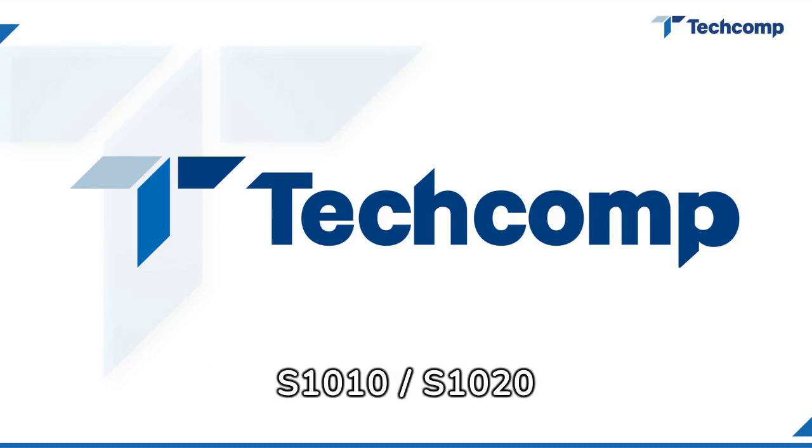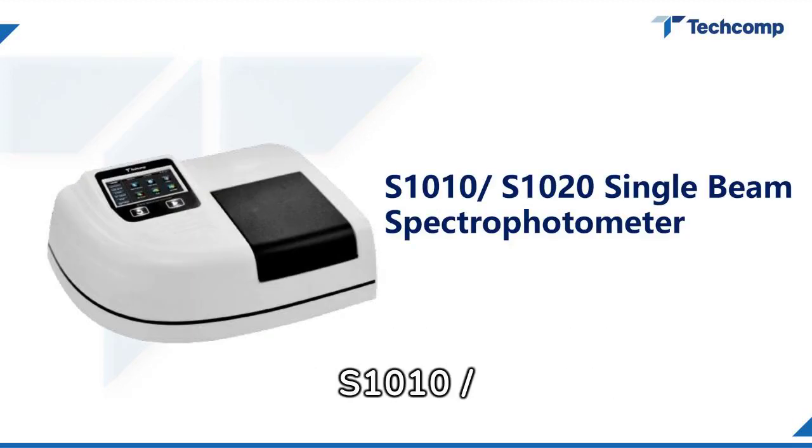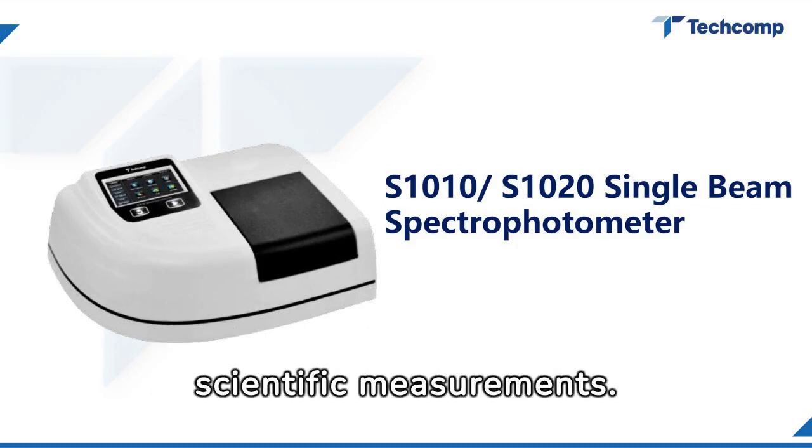Welcome to TechComp S1010-S1020 Single Beam Spectrophotometer's product introduction video. Explore the precision of the S1010-S1020 Single Beam Spectrophotometer, designed for unparalleled accuracy in your scientific measurements.